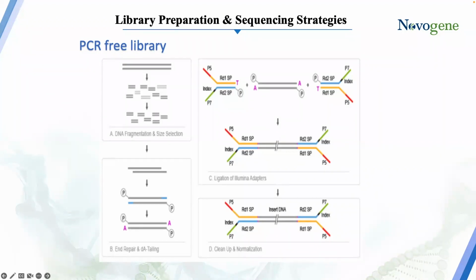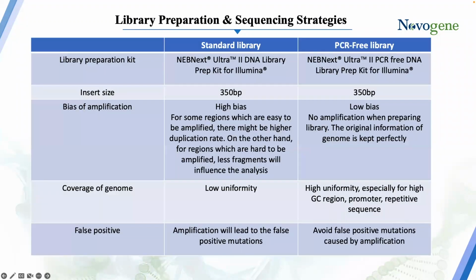Now, why all the fuss about specifying these two different methods, and specifying why one might be used versus another? The reason comes down to the errors that are inherent with using PCR, or the biases that are inherent in using PCR, and some incorporated artificial error.